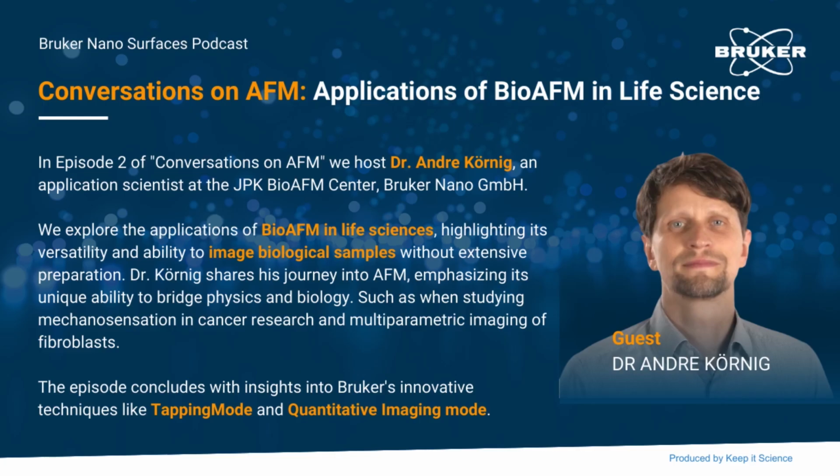And obviously, for those listeners who don't really know too much about BioAFM, I think it's also important to point out that BioAFM is very special because it allows you to perform AFM on samples without the need for a lot of sample processing, and it allows you to study really very small molecules like DNA and viruses to living cells and tissues. So you can have this huge range of samples that you're actually studying.